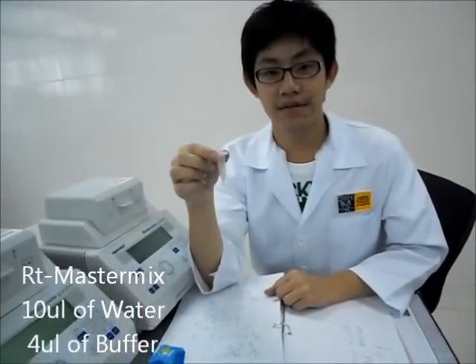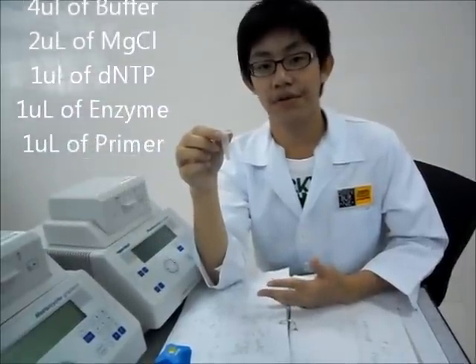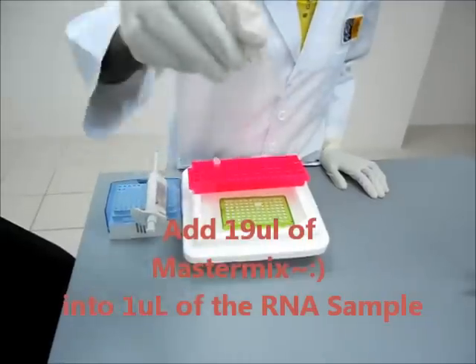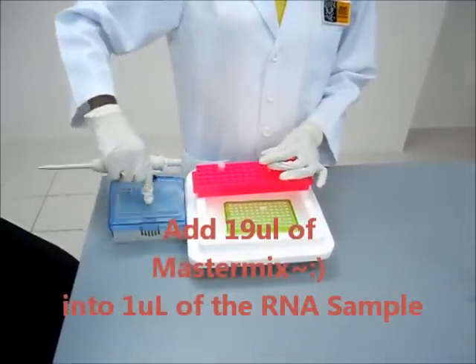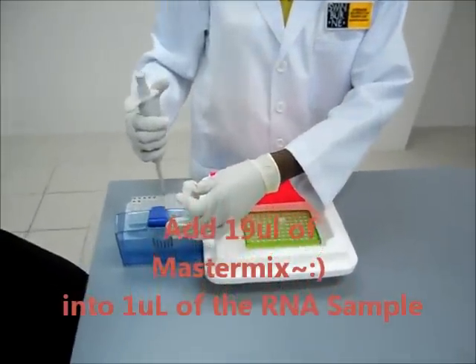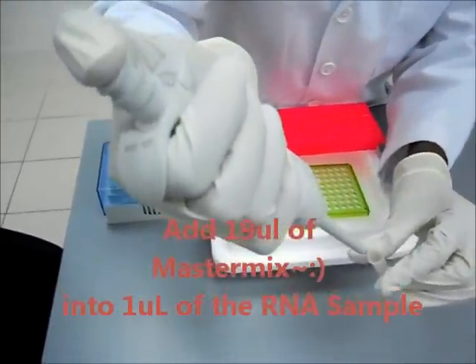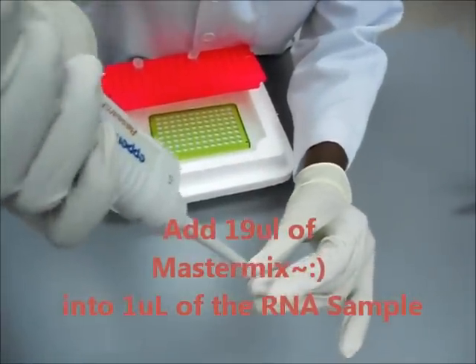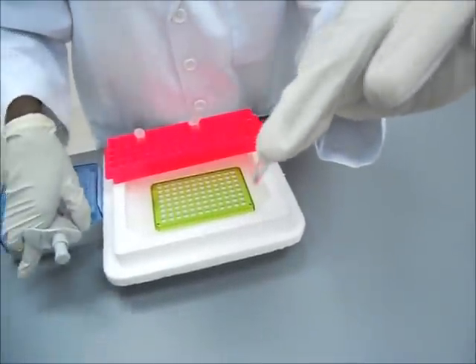RT-master mix consists of water, buffer, magnesium chloride, dNTP, reverse transcriptase, and oligo-dT primer. So we'll take 10 microliters of the RT-master mix. And now we have the final mixture.